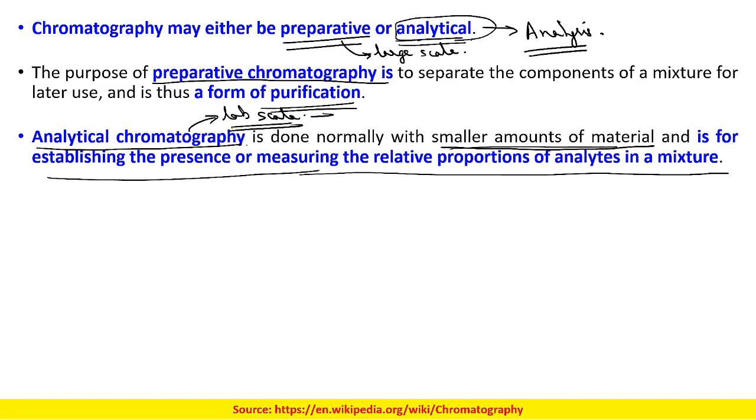while you are trying to find out from a mixture how many components there are, or if you want to find out the specifics of an analyte, using which mobile phase you can segregate the analyte from the system. When you are in the trial stage, we usually use the analytical technique so that we can establish all the protocols properly, and then when we go for scaling up, we go towards preparative chromatography.